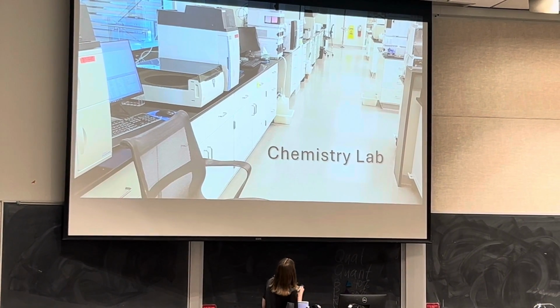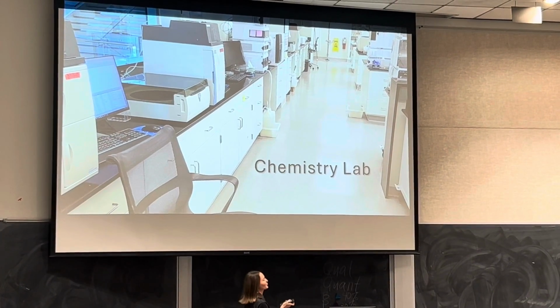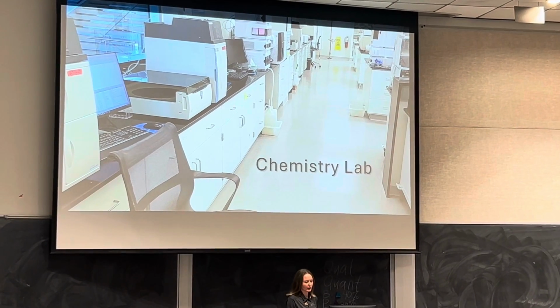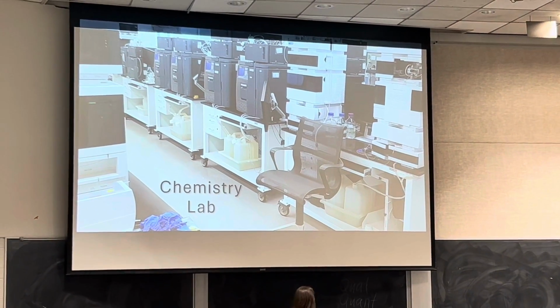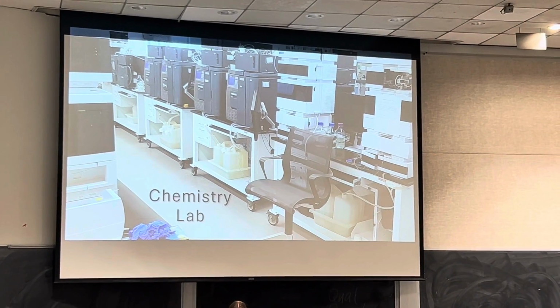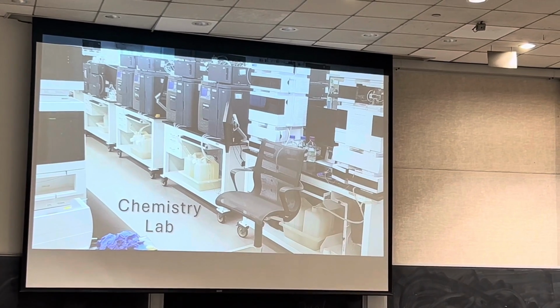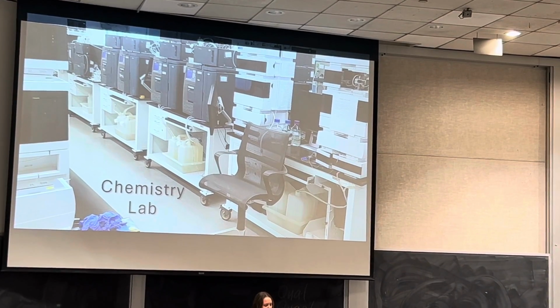Oh, and we have the LCMS right here. This is where Brandon is developing his really awesome vitamins method. It's going to test a whole bunch of different vitamins and some of our dietary supplements. Over here we have some of our HPLC systems. These are Agilent systems where we test our sunscreens, these two right here. And then these are Waters, that's just the manufacturer. They're Waters HPLC systems, and those are generally used for testing active ingredients in our dietary supplements.